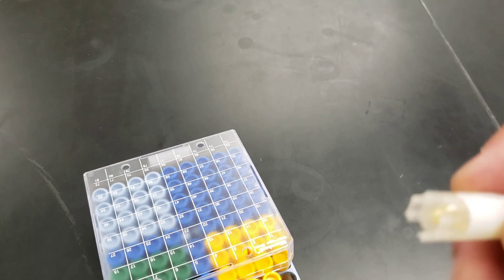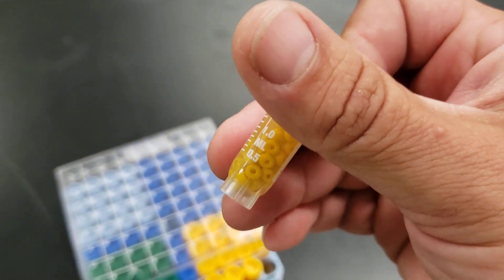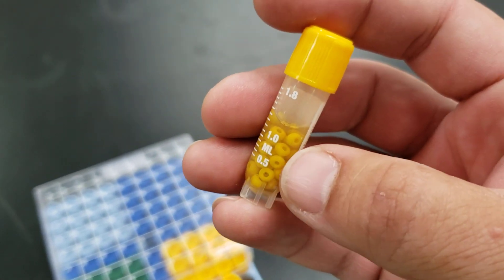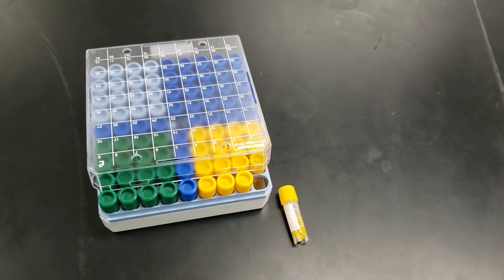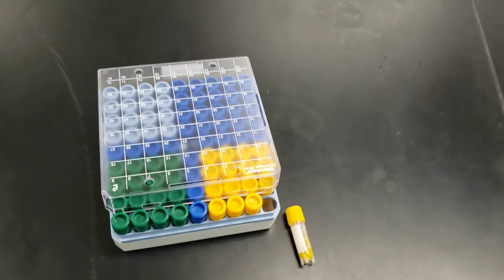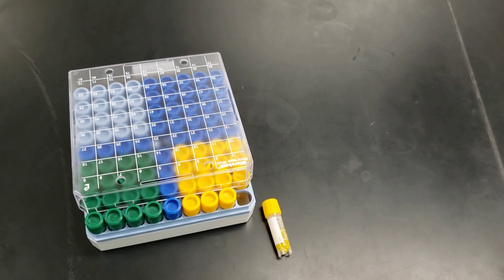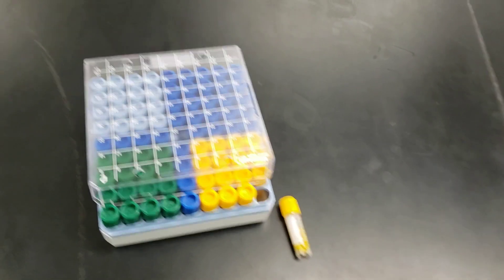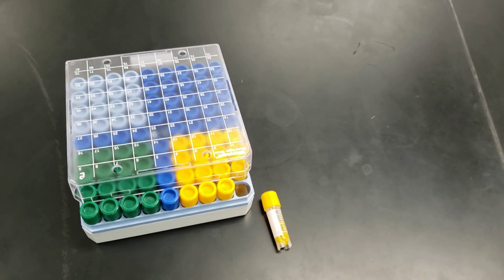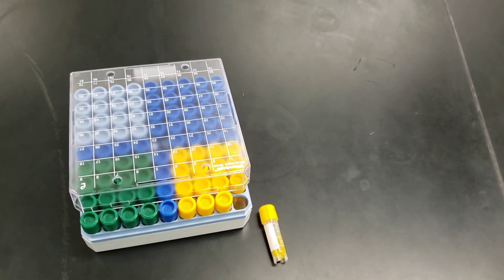I've also switched to a cryo bank system. These cryo bank vials have little beads — students add bacteria cultures containing our plasmids, shake it up, pour off the liquid, and the bacteria coat the beads. These can be stored at minus-20 or minus-80 degrees. The company says they last two years at minus-20 and indefinitely at minus-80. To use them, you just pull out a bead, put it on a plate, shake it around, and start your cultures. This lets me skip the step of re-transforming bacteria cells every year.